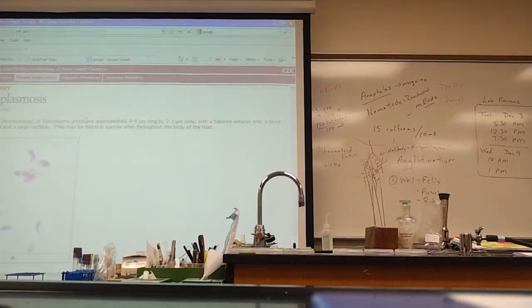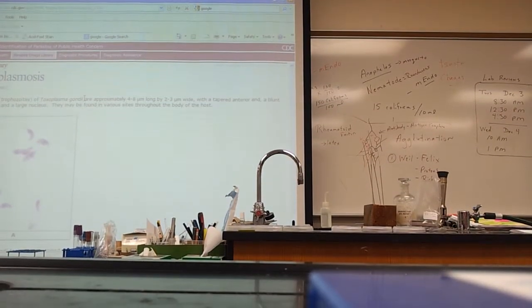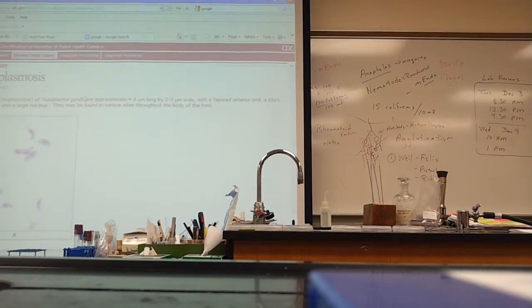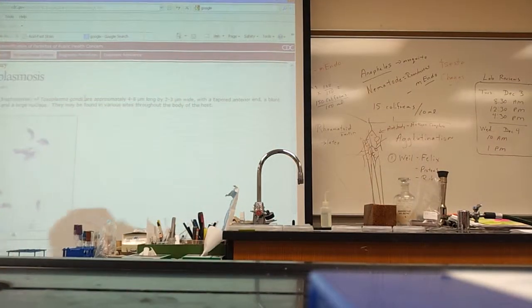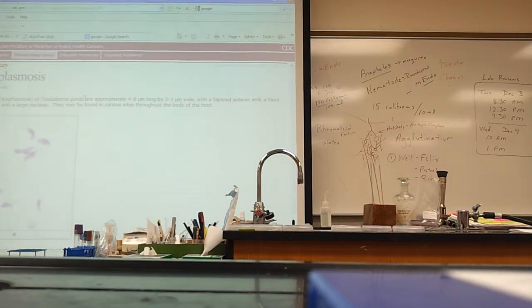First one we'll start with. Let's speed this up, because I want to get down and go look at things. Cestodes. Segmented and flat. There are different species of Taenia. Those are what? They are the tapeworms.